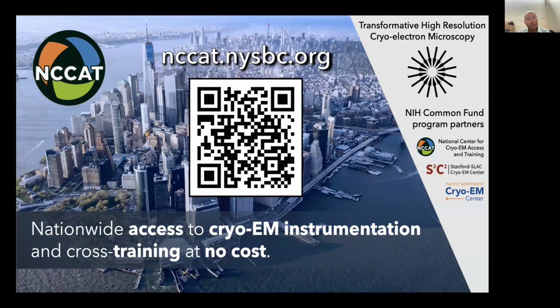Hi, I'm Ed, the manager of NCCAT here in New York. We have 5 Krios instruments, 2 Glacios instruments, a Tundra, and a whole slew of other instrumentation for not only data collection, but also grid preparation and screening, and cross-training.